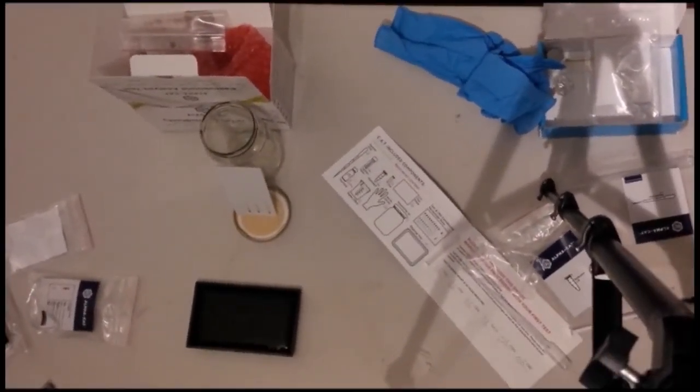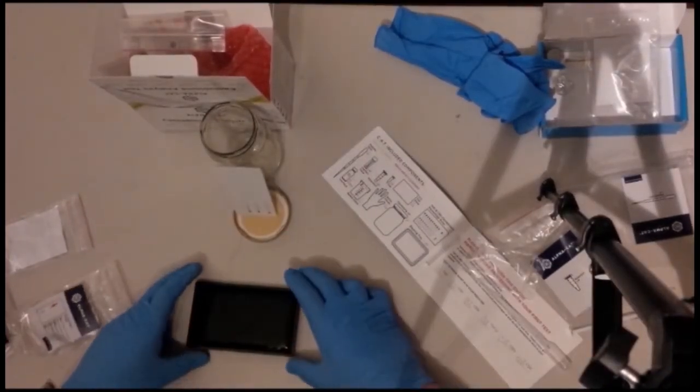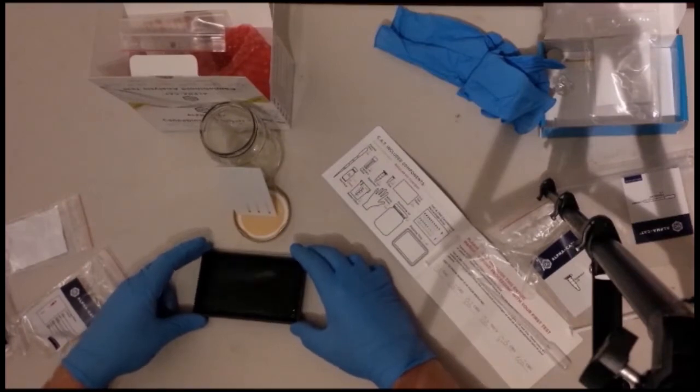The next part is to dip the plate with the coated side down into the tray for only 1 second. The reaction I found was quite aggressive, so I would make sure this is the one part of the test you do not take your time with.